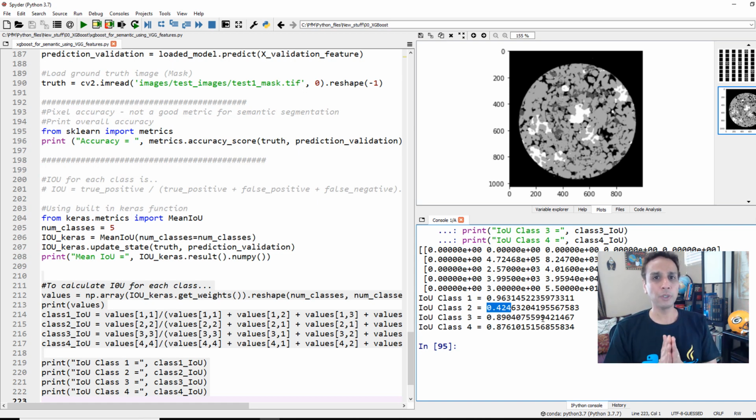Okay, I hope you really found this tutorial to be definitely long, because I know this is almost like 30 minutes or so, but definitely worth watching. And this type of semantic segmentation, you will find that this is comparable to UNet, for example, especially better than UNet if you don't have a lot of training data. If you want to do exactly the same thing using a UNet architecture, you need a lot more training data, and most of us do not have that. So please think of XGBoost as your first option when it comes to classification or segmentation.